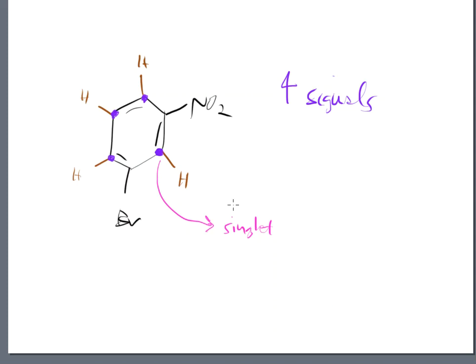All right, so as we work on around, let's go to this one now. If we look at this proton that's on a carbon, well, to the right-hand side of that, there's no proton, so I don't count it. And up above, I see a carbon with 1 proton. So this is going to be 1 proton plus 1, and that's a 2. So that means this is going to be a doublet. All right, so that's easy enough.